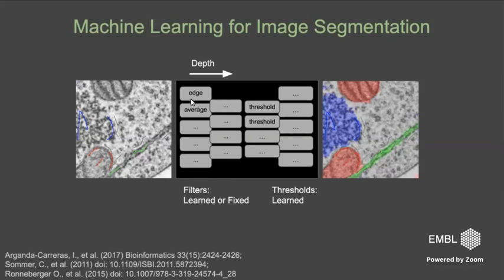With deep learning, you typically apply a sequence of filters, so filters of filters of filters of filters, and the more you do this, the deeper the deep learning is. And the other important thing is you actually don't specify which filters you give, but these are all convolution filters, like the kernels I showed you before, but the entries there, like the 1/25 or plus and minus 1, you don't give them. They are also learned by the algorithm. So the algorithm learns also what is actually the best sequence of convolution filters to solve the task. And that's the deep learning methods.